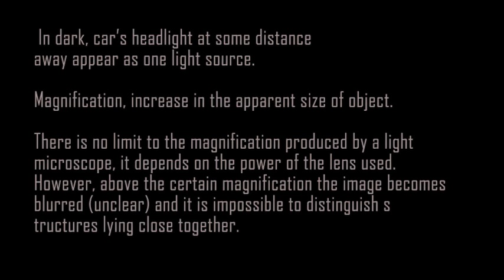If taking photograph, it will also show one light source. Now, what is magnification? Magnification means increase in apparent size of object. Why do we increase the size of an object? The object size is increased to be seen clearly.